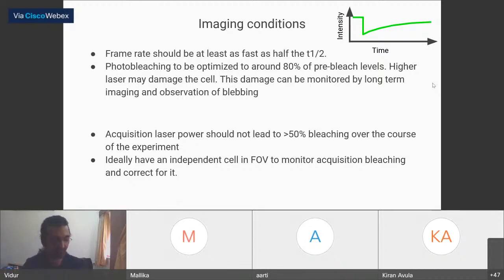What I understand from dynamics of vesicular structure, one is if the vesicle is larger than the diffraction limit of light, such that you can monitor two different regions. Let's say things like the ER. In the ER, people have done localized photobleaching and assessed recovery within ER as well as dynamics of ER over time.